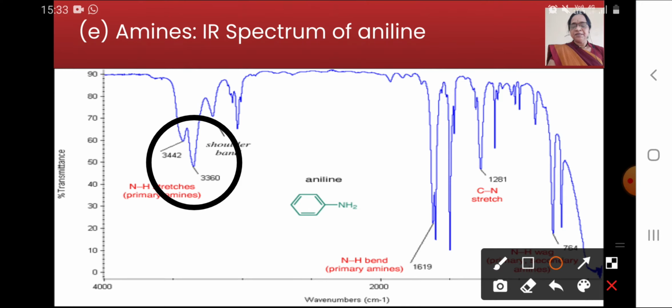These bands appear in the spectra of compounds determined as a neat liquid and are seen most easily in the aliphatic amines. The CN stretching absorption occurs in the region from 1350 to 1000 per centimeter as a medium to strong band for all amines.